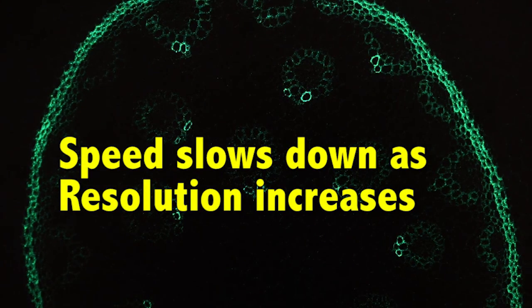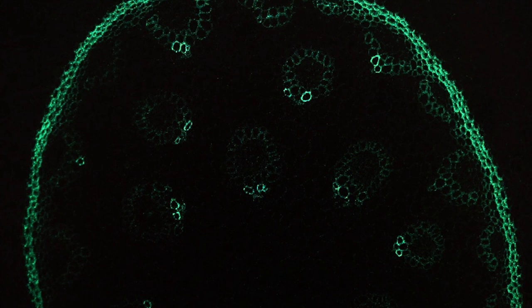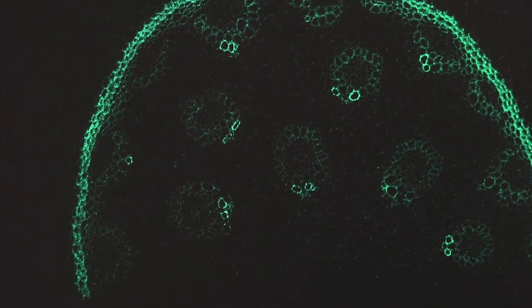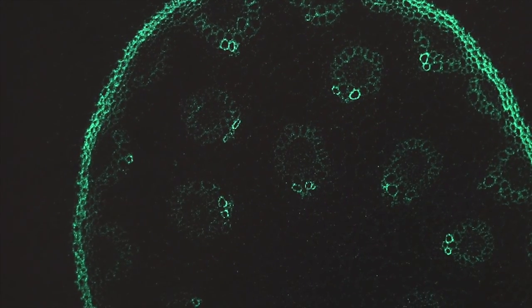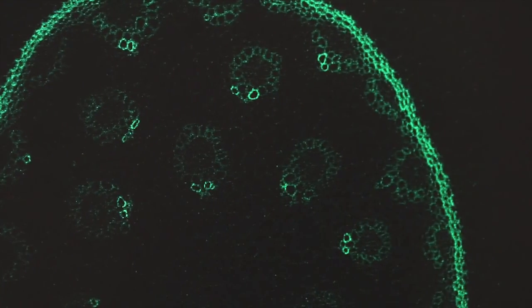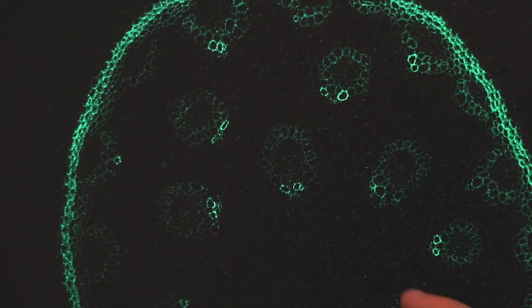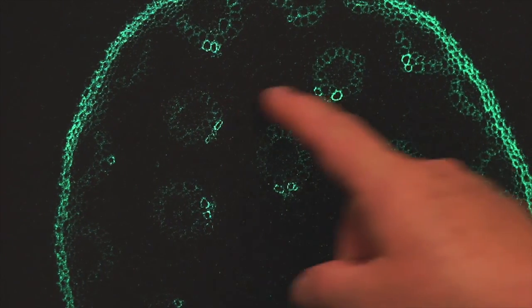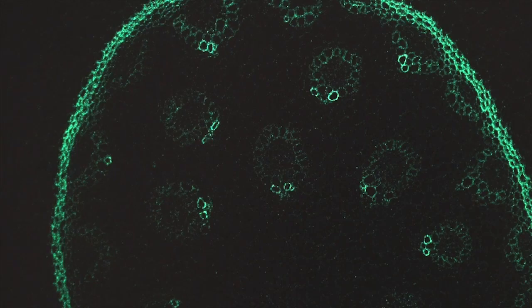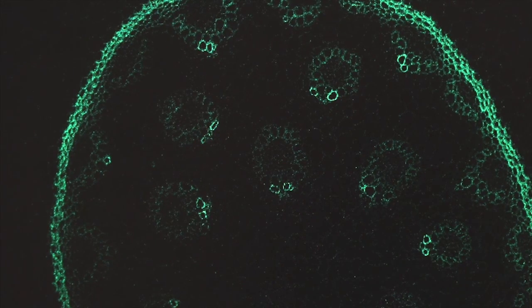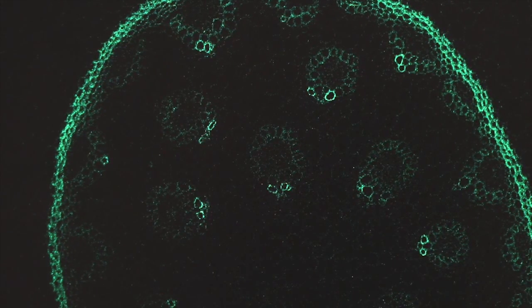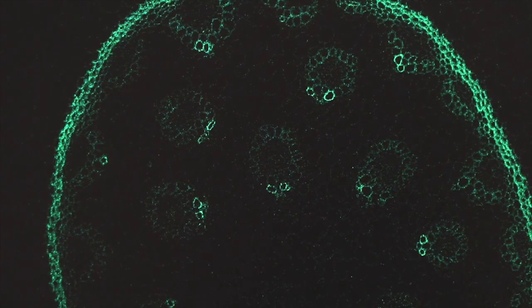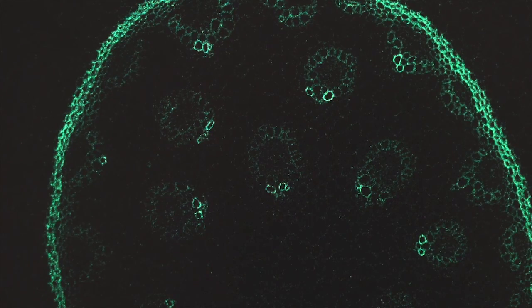If I go to a resolution of 2K by 2K and I capture image, now you see it's slower still. And so this can have an impact on your fluorophore if you're hitting it with too much energy. Another thing that you'll notice is that the amount of noise increases as my resolution increases. Again, to eliminate the noise, I would use line average or frame average.